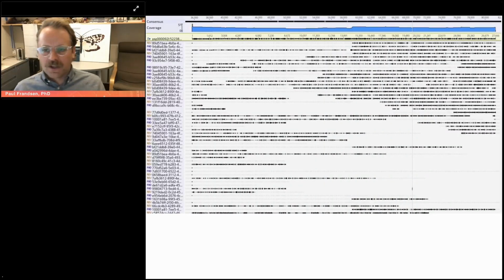So this is a little bit of a complicated diagram, but I'll try and walk you through it. On the top, there is a sequence, and this is the consensus sequence of the heavy fibroin chain protein. So what we noticed is that we were getting really poor assemblies with Oxford nanopore, the older Oxford nanopore tech. And the reason for this is because it is noisy data. So basically, even though they can generate long reads, there are many errors within those reads. And so each of these lines represents a read. And that read has been kind of mapped back against the consensus sequence of the protein.